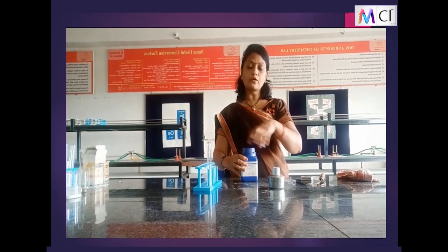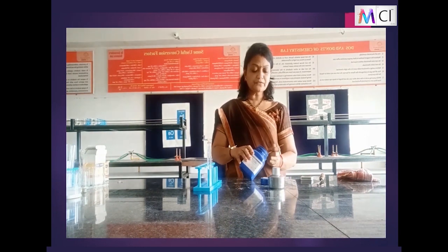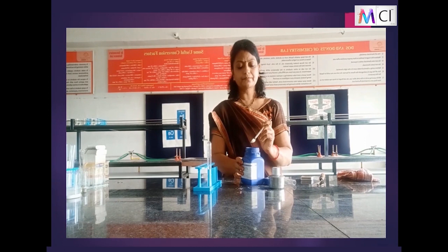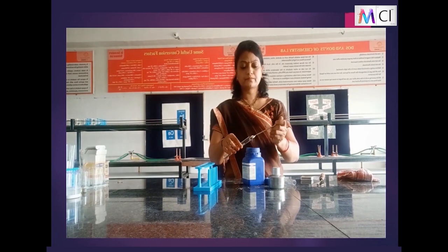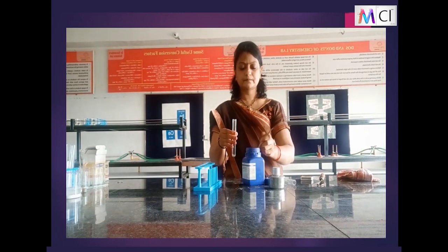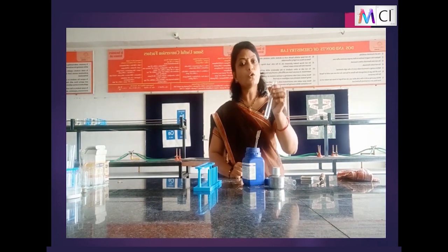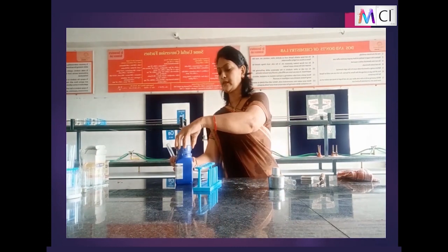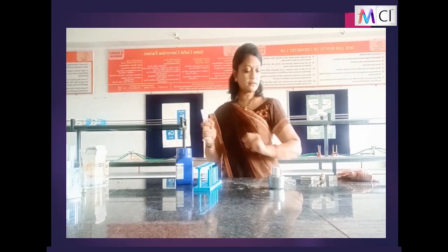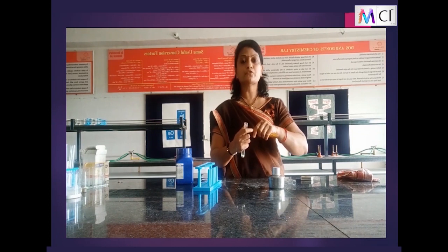Let us see the color of this ferrous sulfate. Children, it's very important to observe the colors of the salts when you are using them. Okay, see here, it is greenish in color. Right? Ferrous sulfate has a greenish color. So I will take it in a test tube. A small sample of ferrous sulfate I have taken in the test tube. Always you should close the mouth of the sample container which we are using so that we can prevent it from moisture.